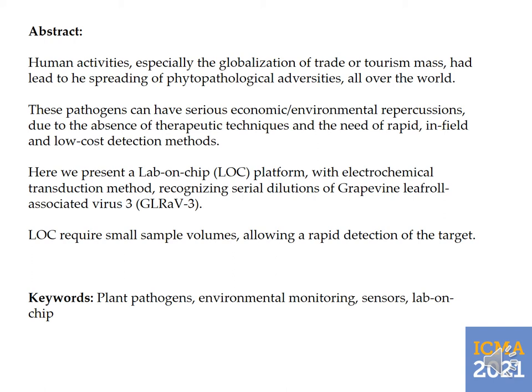Here we present a lab-on-chip platform coupled with a microfluidic model based on an electrochemical transduction method, able to recognize serial dilutions of Grapevine leafroll-associated virus 3. LOC represents smart and versatile devices thanks to their miniaturization. They require small sample volumes, allowing a rapid detection of the targets.